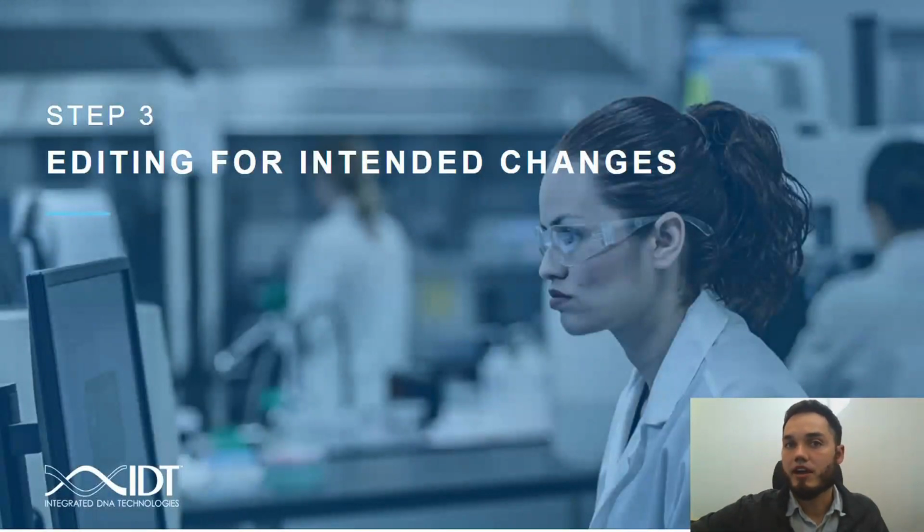Now that we've talked about the guide RNAs and proteins used to edit the genome, we can discuss some of the different reagents and oligos used to drive editing towards intended genomic changes.